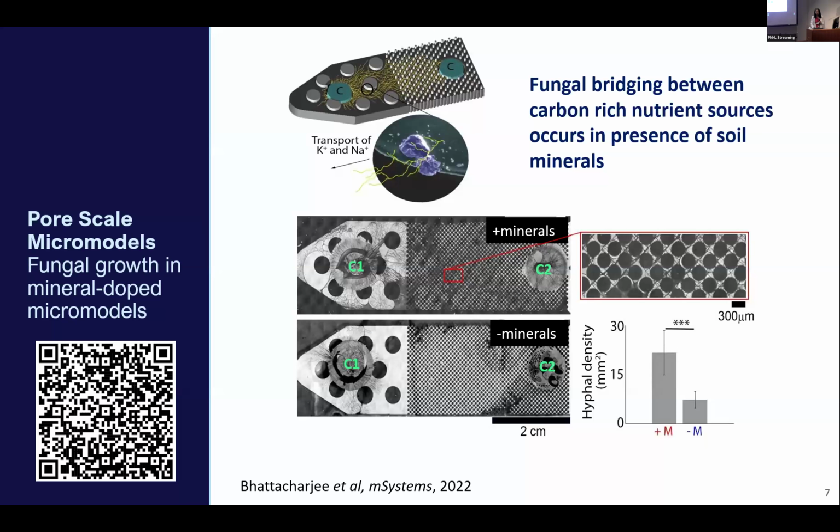And so I'm going to describe some of the platforms that we have currently here at EMSL. We have platforms called pore scale micromodels. These are our smaller platforms, which are used only for microbial incubations, and some other work that we have done with users, such as looking at organic matter mineral interactions. That's one of our current projects.